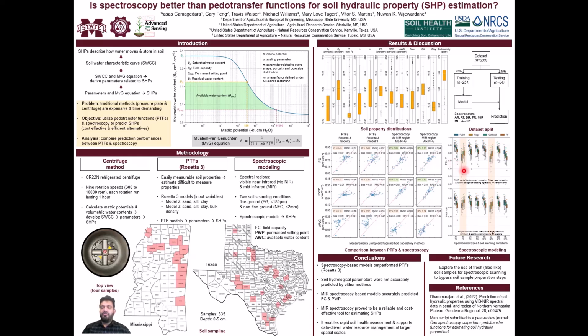However, when we use the AT spectrometer, we can see a different pattern where random forest shows the best performance followed by categorical boosting. We suspect this variation is mainly due to differences in spectral acquisition.